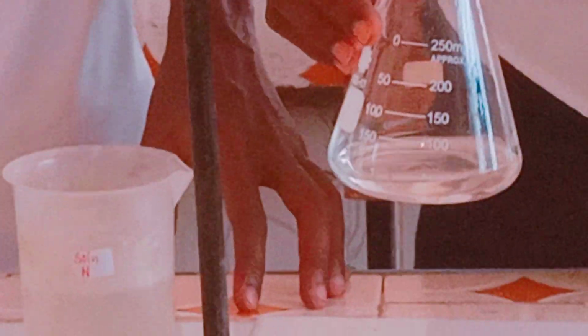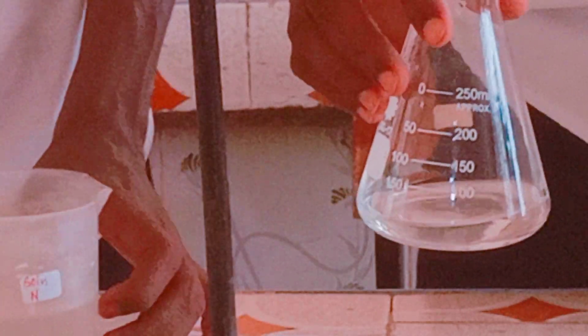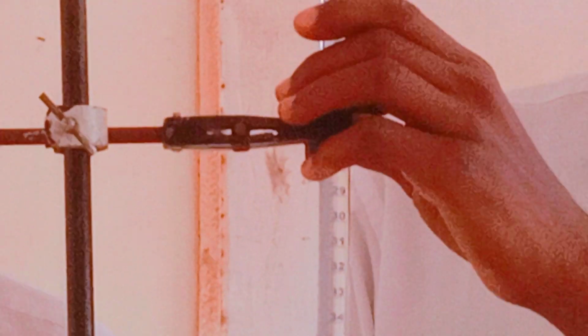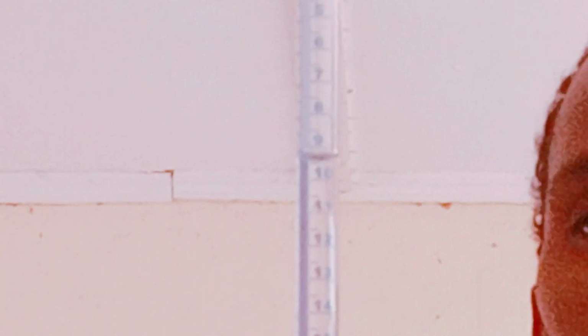Now the solution turns colorless. Initially it was pink, but now the solution has turned colorless. Now I want us to read the titer volume. What is the titer volume? If you check it well, for the first experiment the titer volume is 9.1 cubic centimeters. That's where the end point of the reaction is.